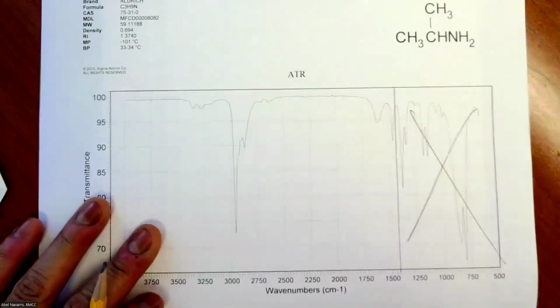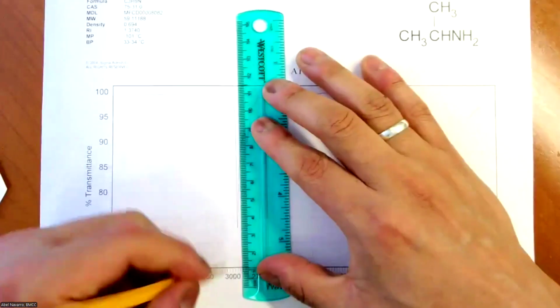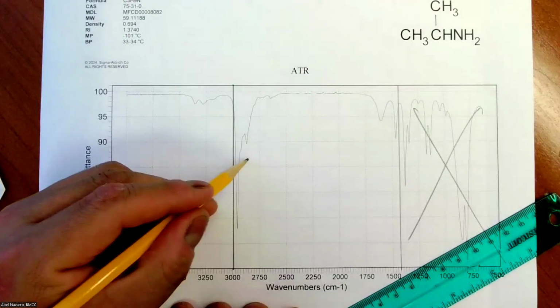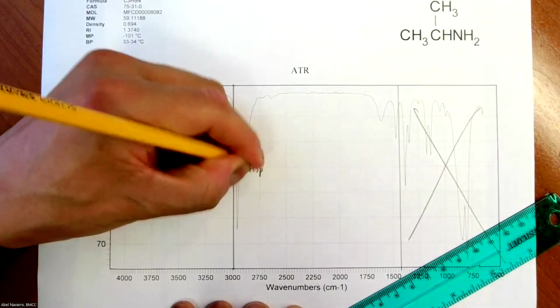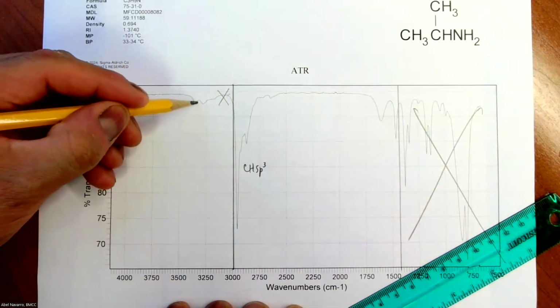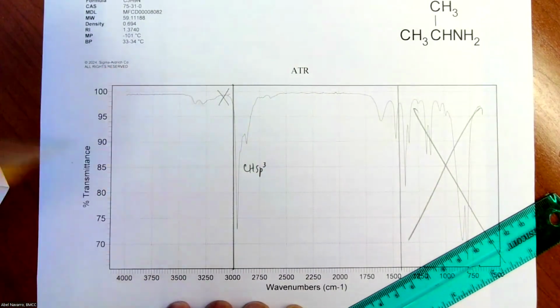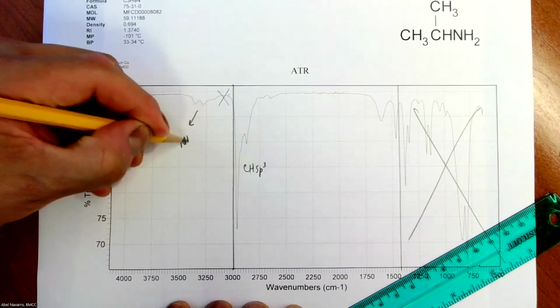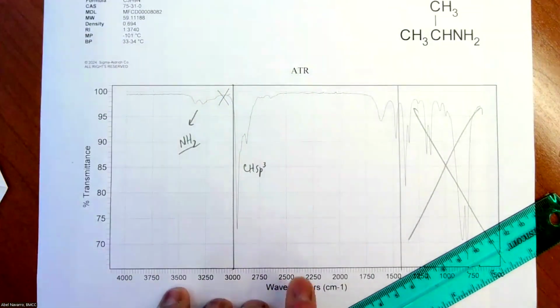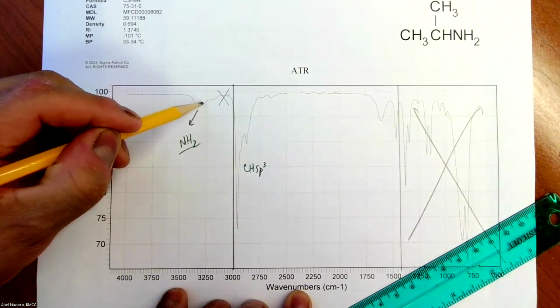Now you see everything. 3000 line. Right below 3000, CHSP3. Right above 3000, nothing. What are these two bunny ears? Those are NHs. NH2, right? I could even write NH2 because it's two of them.